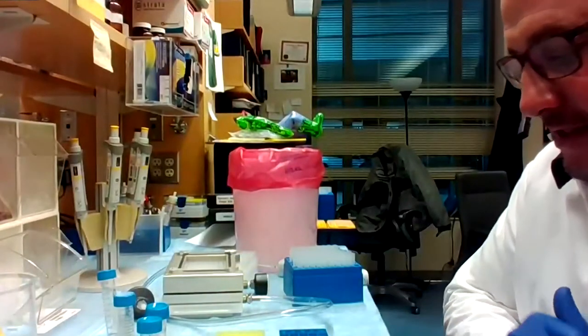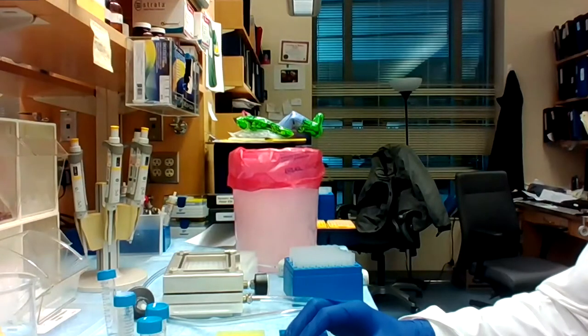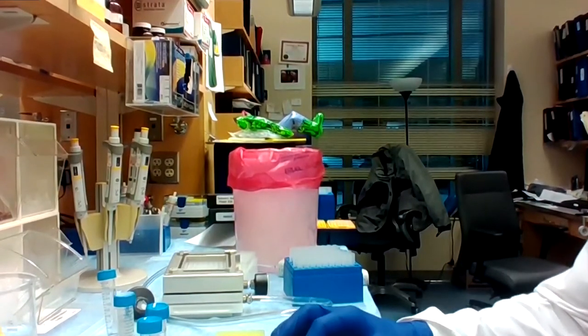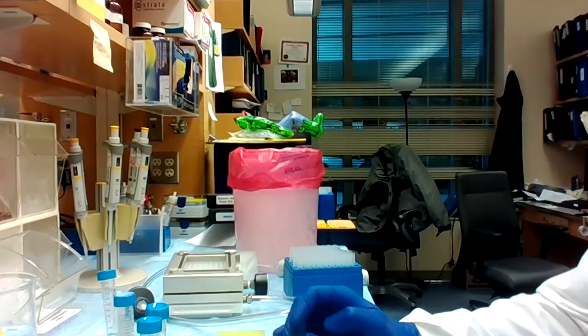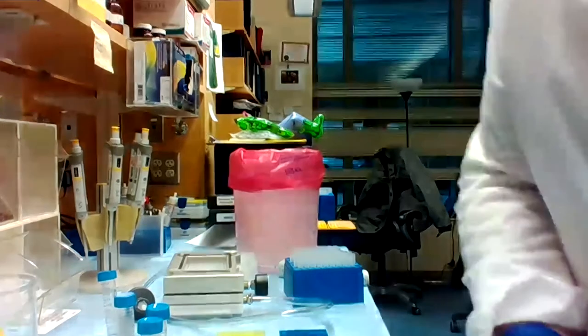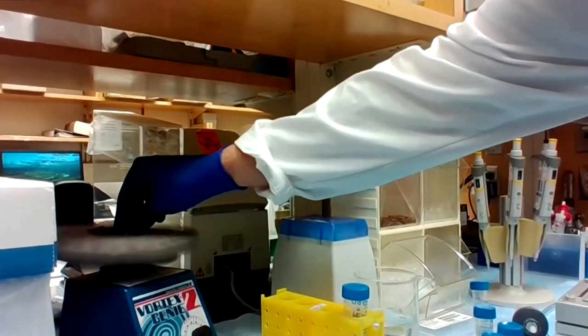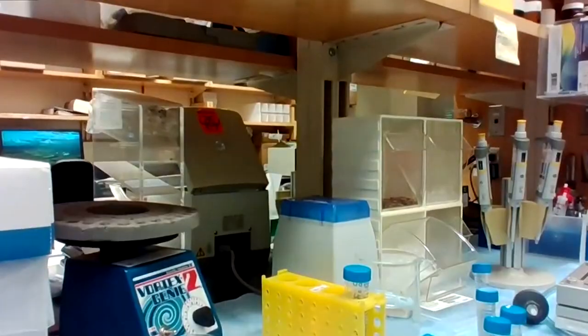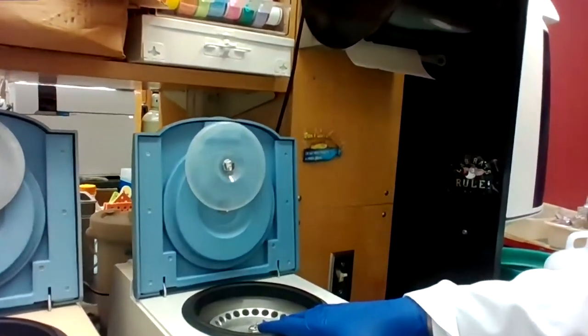Today we're going to use the MTBE — methyl tert-butyl ether — extraction technique. Once we add the plasma and the ether, the next step is to vortex the samples. I usually do that for one minute. When that's done, I will use a centrifuge and put the tubes into the centrifuge for five minutes at 17,000 times G.